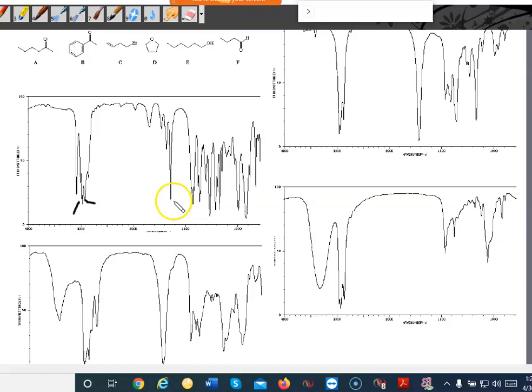But it does definitely look like you possibly have a carbonyl. It's right on the border there, 15, 16. That's about 1650. It's getting a little low, but it mostly looks like a carbonyl. But the fact I give you options, it has to be a carbonyl, because it's the only molecule that has both aromatic and aliphatic. All right, so this would be for structure B.